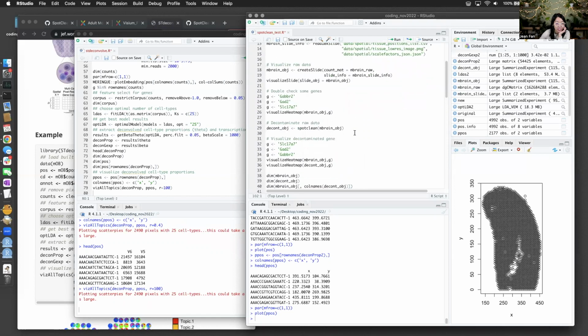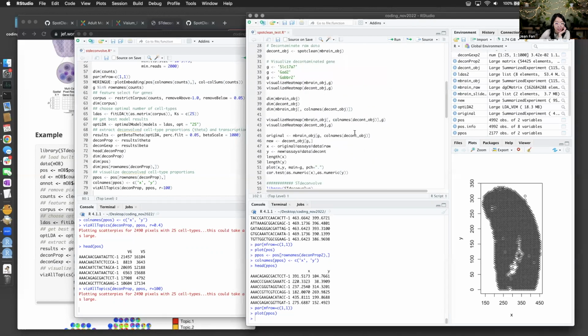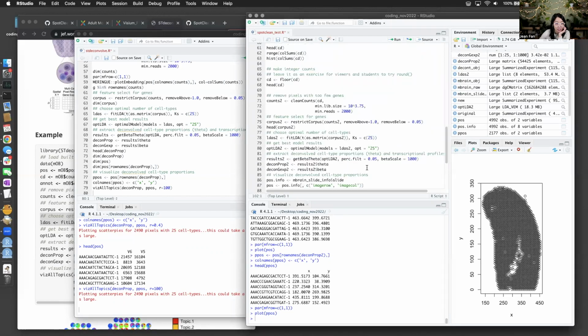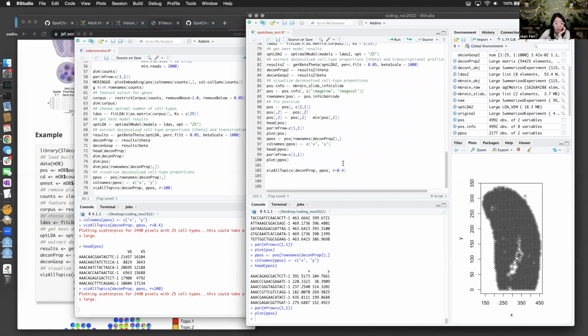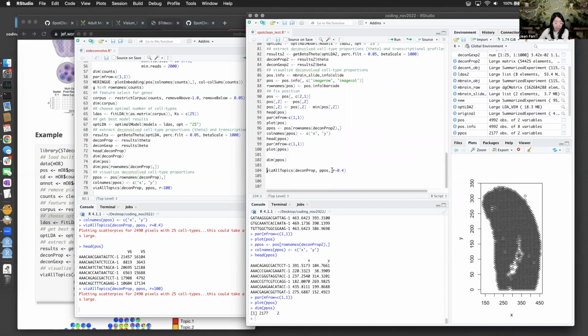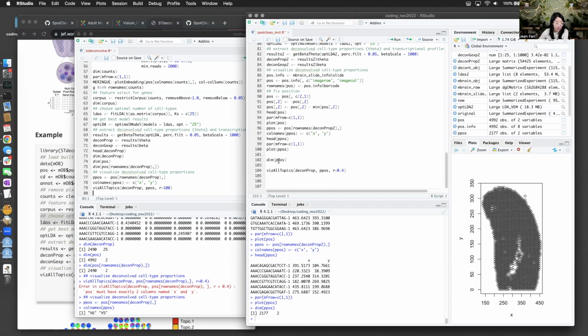Just want to make sure that we're comparing apples to apples later on. And anyways, so what is the dimensions of... yeah, so this is quite a few spots smaller. Let me double check. Yeah, we're missing quite a number of spots, and my guess is they're the ones corresponding to these.